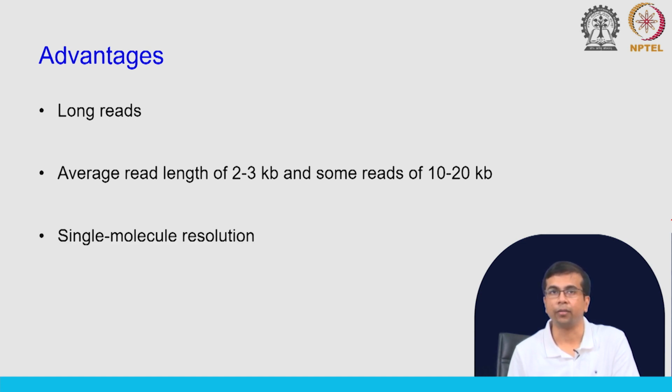We have single molecule resolution. We have seen we are getting this data from a single DNA molecule. We are synthesizing the complementary strand of a single DNA molecule, and this process is happening across multiple wells, multiple ZMWs, as we have discussed. With millions of these ZMWs, we are getting parallel signal, which will give us sequence for millions of molecules, but at single molecule resolution. So, it is incredibly powerful.